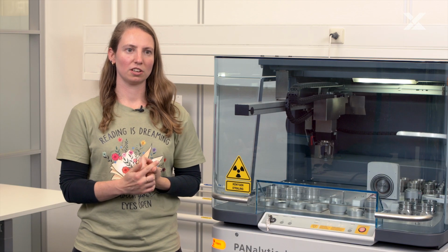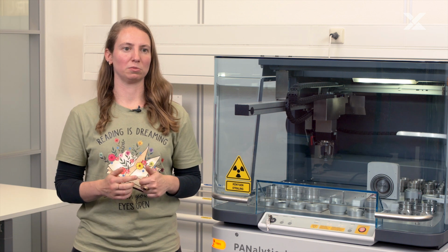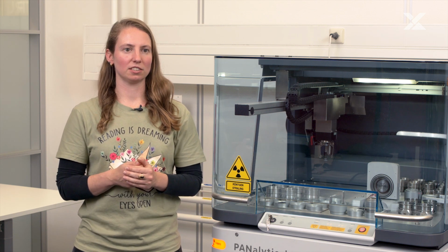The project had several challenging aspects. First, there were no commercial certified reference materials available. And second, the customer did not have the resources to produce calibration standards on their own.